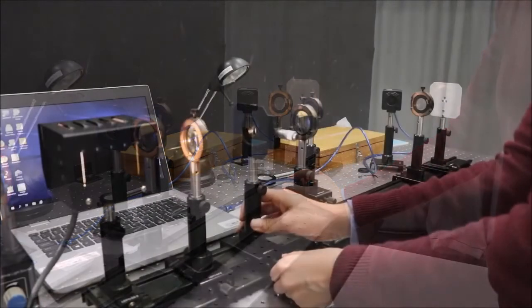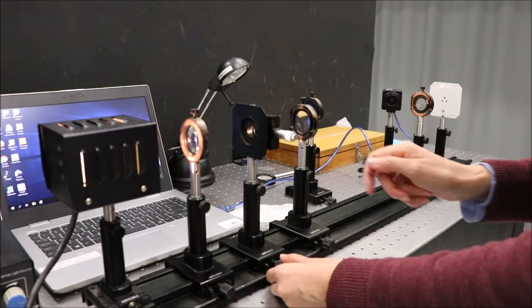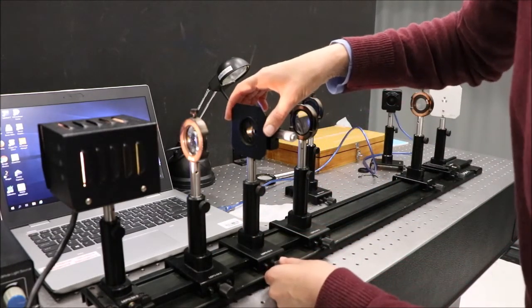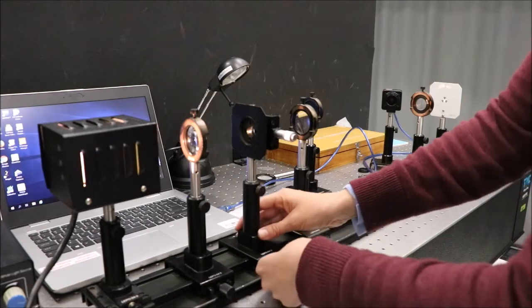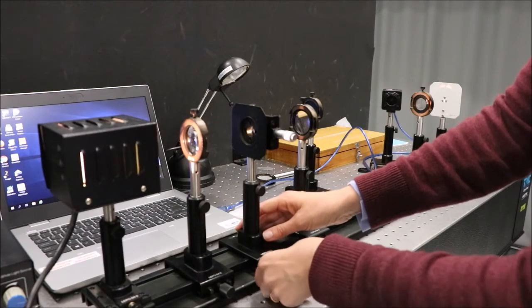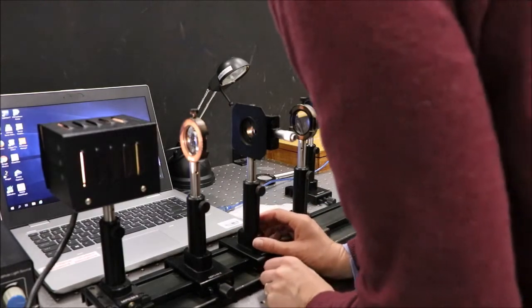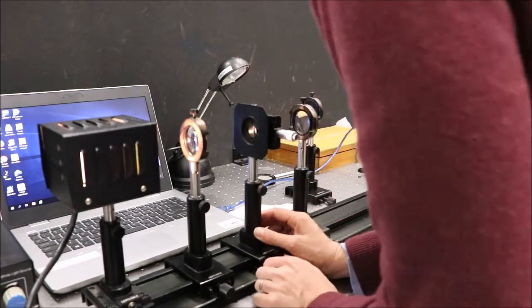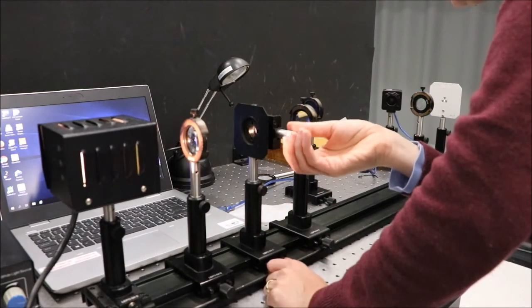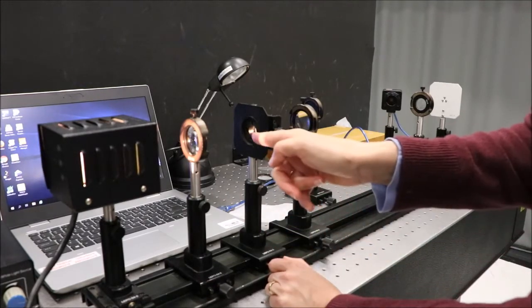Now add the slit roughly halfway between the collector lens and the collimator lens. Make sure that the slit is vertical. Close down the jaws of the slit and move it back and forth until you have an image of the filament being formed on the slit.